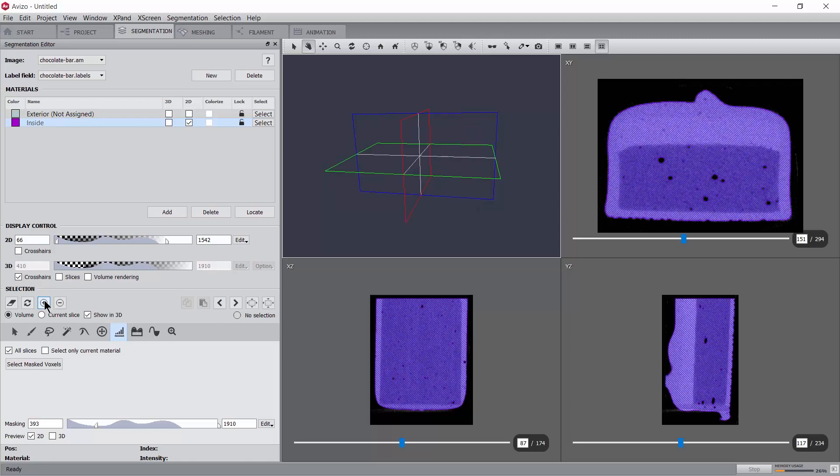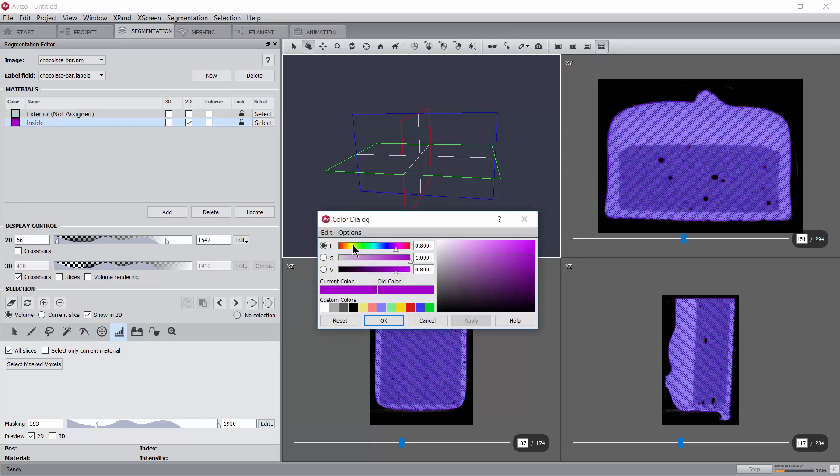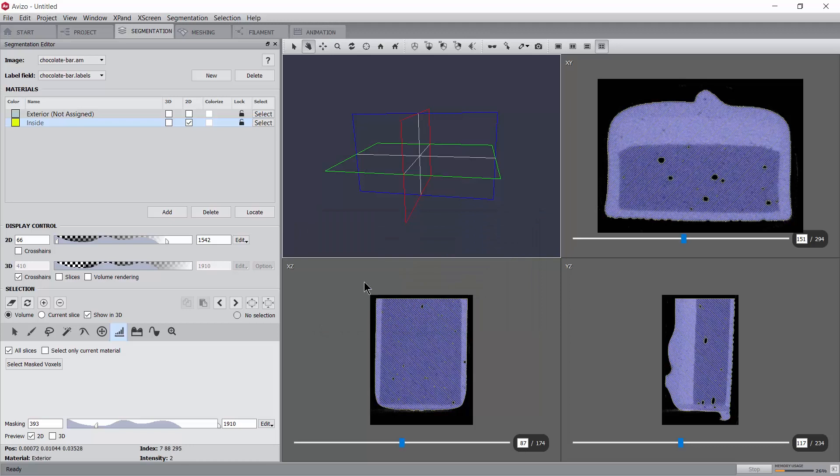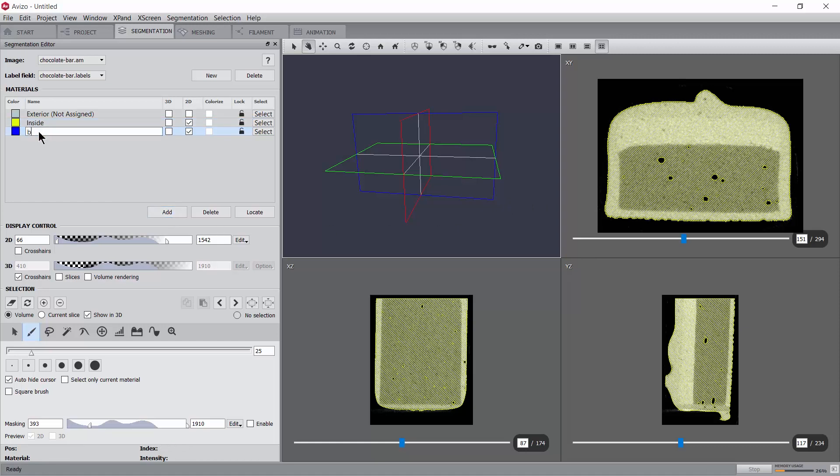You may rename the material, change its color or appearance in the 2D viewers at any time by right clicking on the material name. It appears that the chocolate bar contains many large air bubbles which were not captured by the threshold operation. In order to capture them and assign them to a new material, let's first create that placeholder and name the material bubbles.